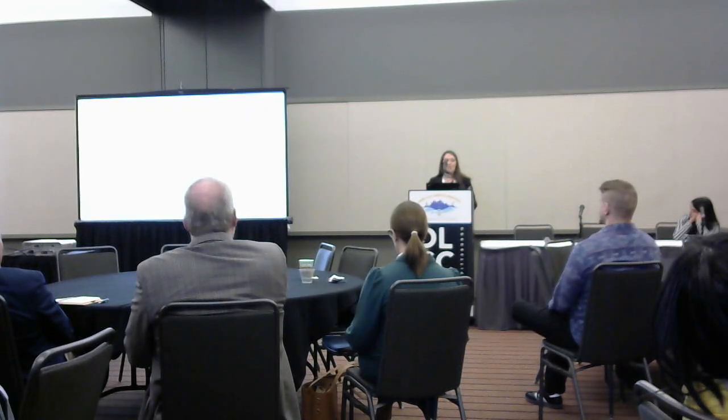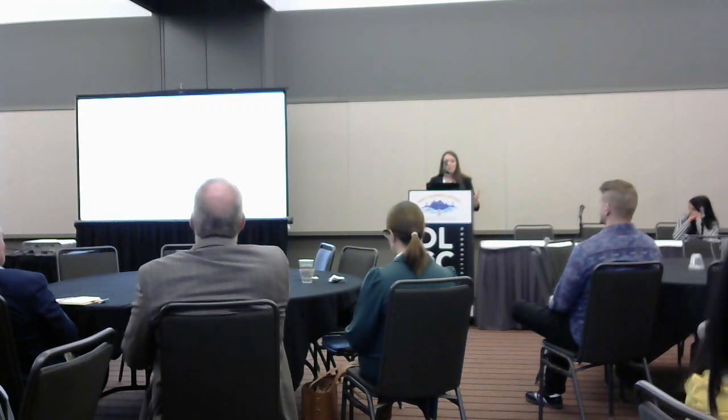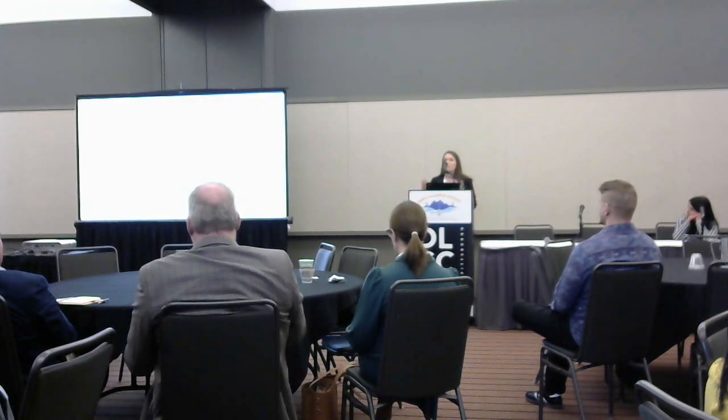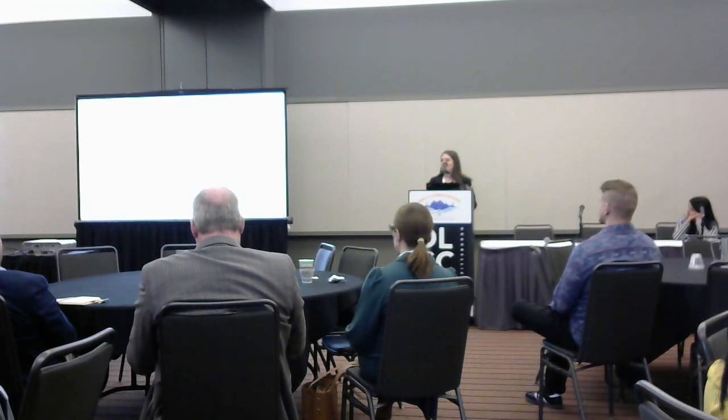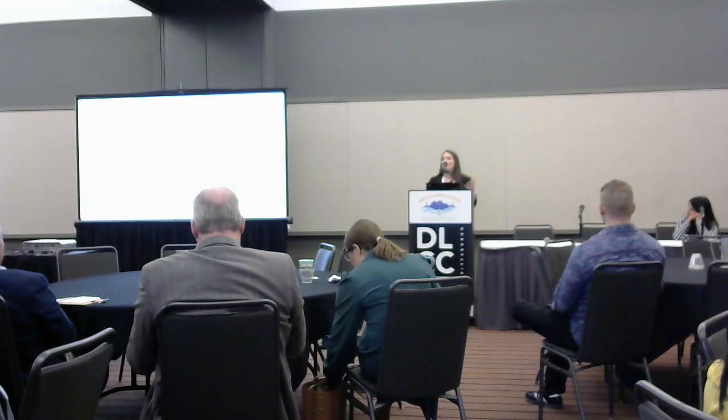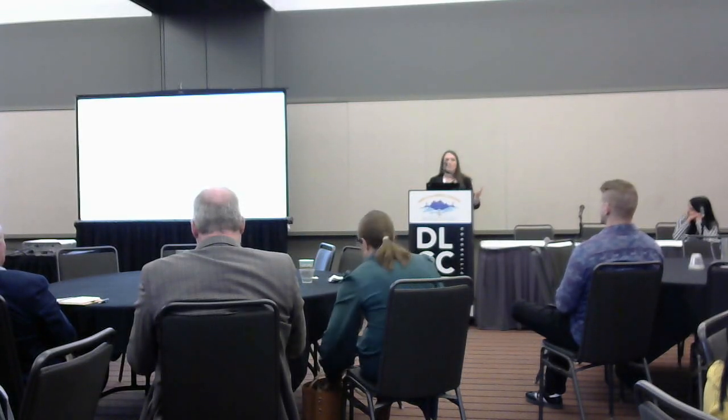Every single image analysis scenario is different, as I just alluded to with the number of choices that you have to make along the process, so every good enough is also different based on your images, but also based on the question you're asking. So just to give you a very specific but relatively simple example of this, counting objects. We care about that a lot. But lots of things go into how we can count objects, and how effectively we can do that.